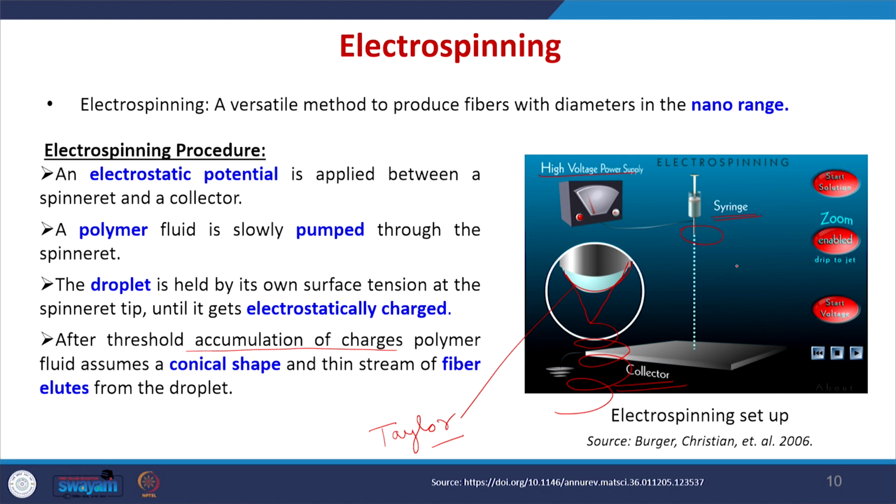This is a vertical electrospinning setup. You can see the collector and spinneret are kept vertical.